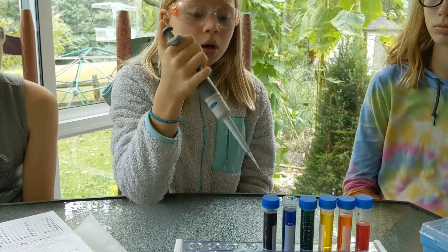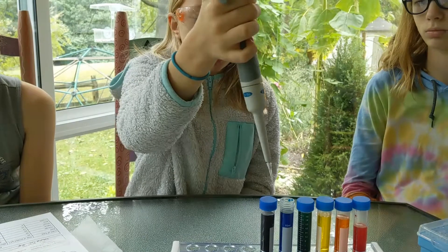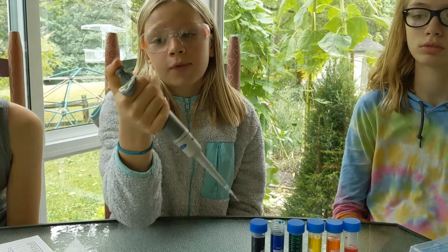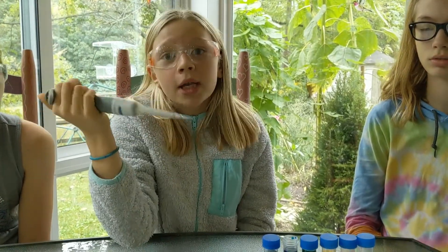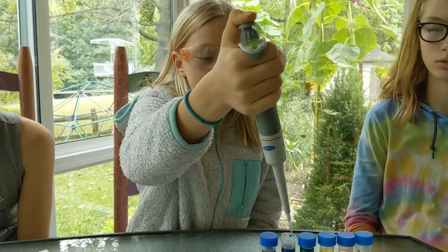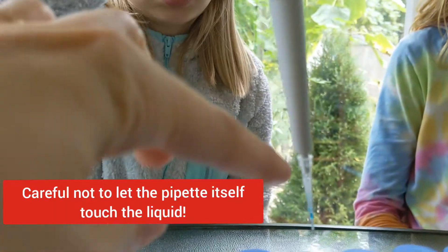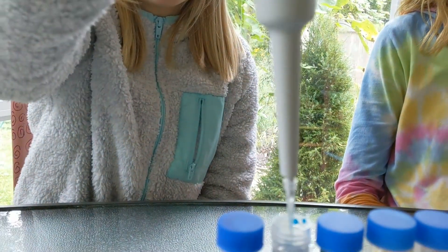When you are getting your liquid, before you get your liquid you want to push down to the first stop before you go in. Only go down to the first stop because if you go down twice to the very bottom then you're going to get way too much. Also, never let the end of the pipette itself go into the liquid — only the tip should go into the liquid.